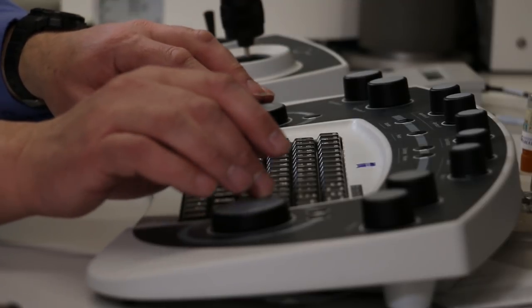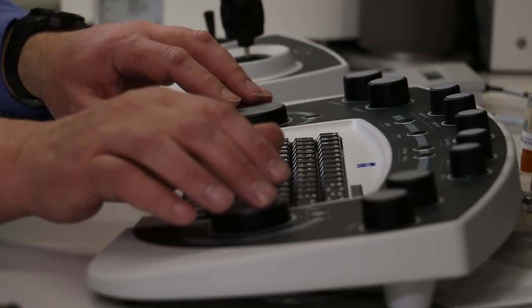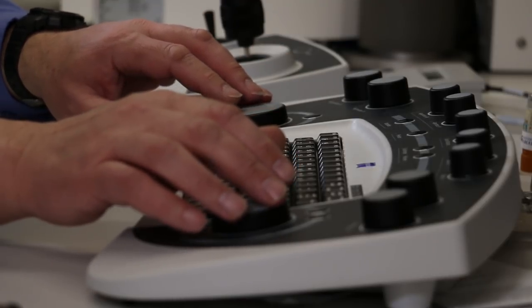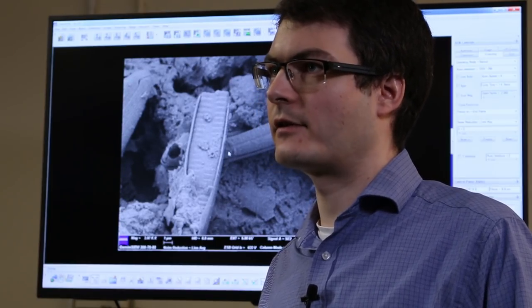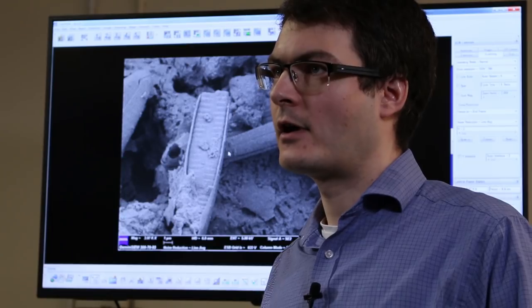We have a very high percentage of our users being PhD students and also master's research students, but we also have students doing undergraduate projects on the instruments. We bring students down here for demonstrations.